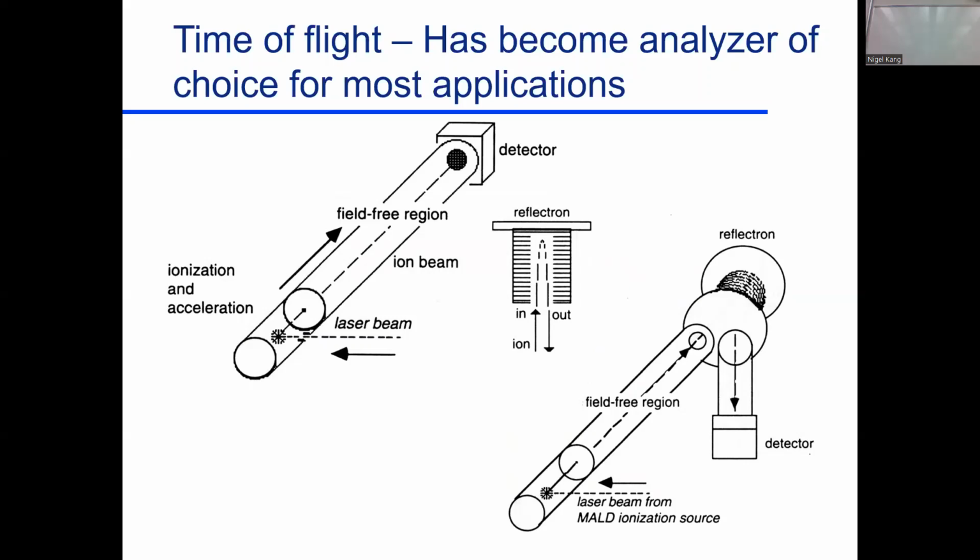And this is an interesting one too. Here we've got a laser beam coming in here. Your sample comes in, you hit it with a laser beam, you put it into pieces, and then you have a charge here, so we get these particles moving out. And now, you probably remember someplace, kinetic energy is 1/2 mv². Does that sound familiar? Okay.